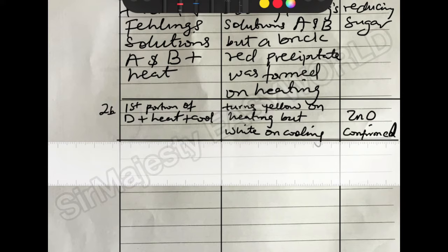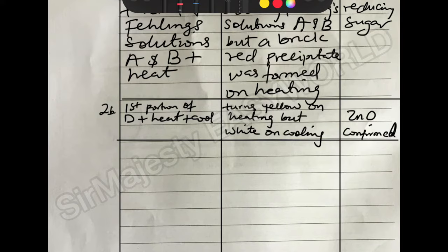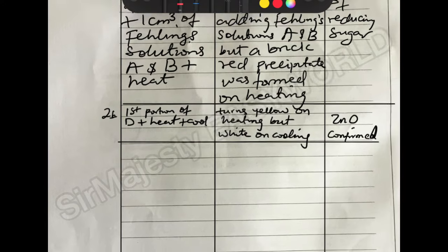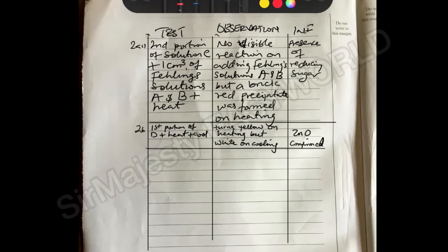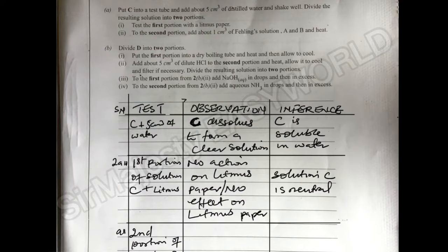The other one says dissolve in HCl and then heat, then filter if possible. To the first, they said to add 5 cm cube of dilute HCl to the second portion and heat, allow it to cool. Simply, dissolving D in 5 cm cube of dilute HCl.